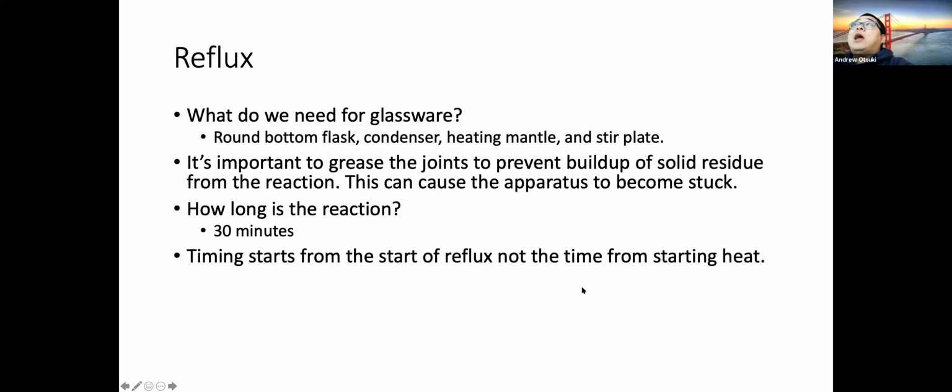So until then, you're probably not going to have enough energy to do the reaction. So it's not going to go very fast. So if you start from the time you turn on the heat, you may get lower yield because the 30 minutes of reflux time is important to drive the reaction forward.